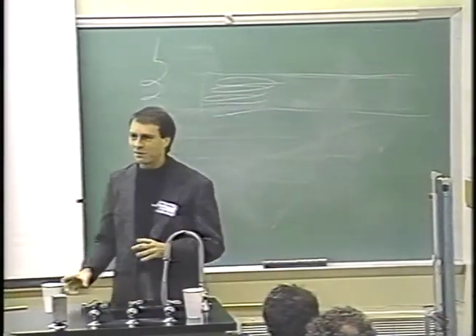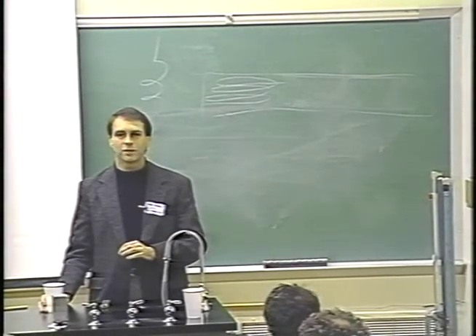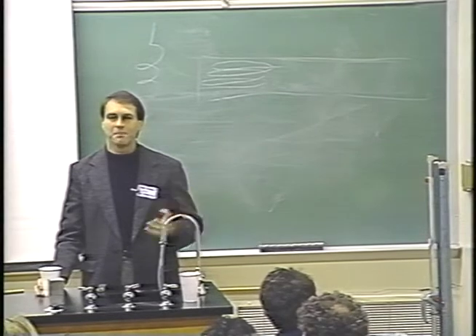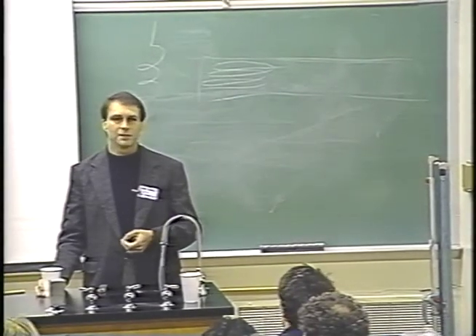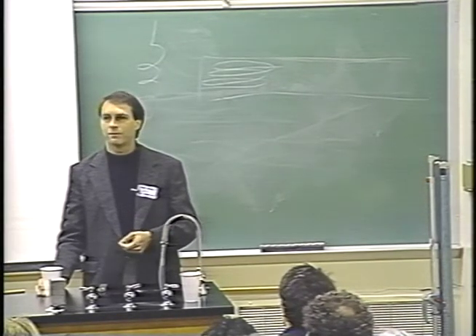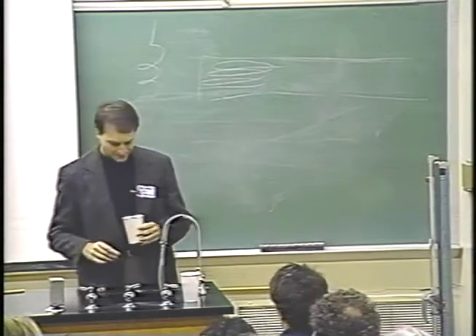But that doesn't really matter. The technology and the techniques for doing this kind of reconstruction are now here, to the point where instead of being a many-month project, one can start thinking about doing these in a much more facile fashion, which makes it much more accessible to the whole field of structural biology and cell biology. Thank you.